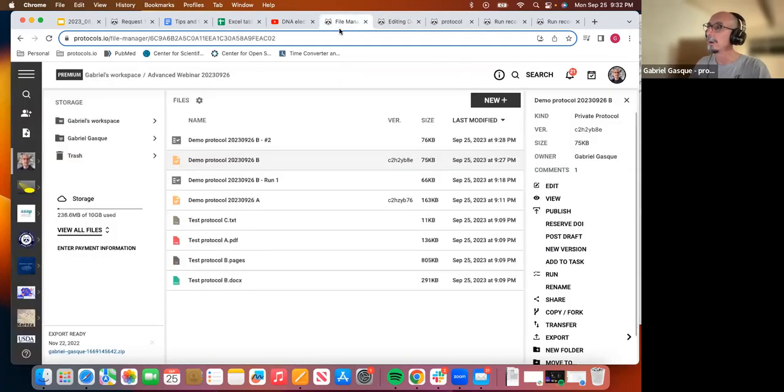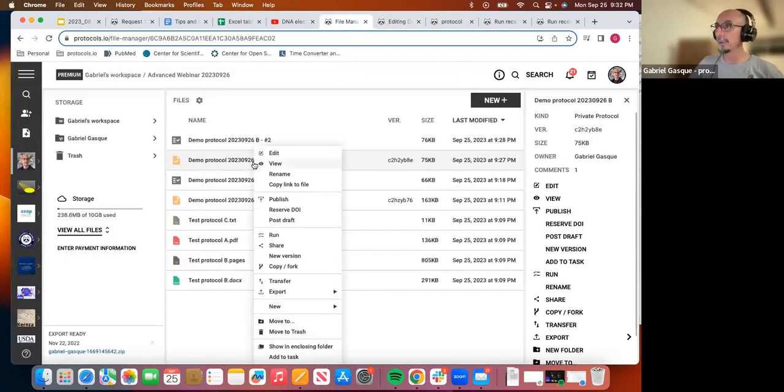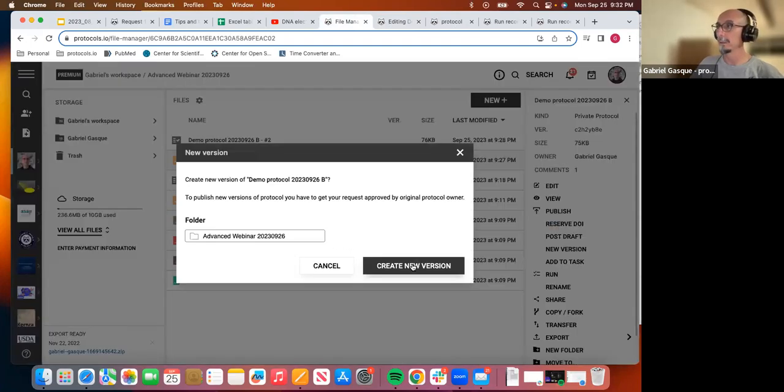And to do so, I select my protocol, I copy new version. It's working.